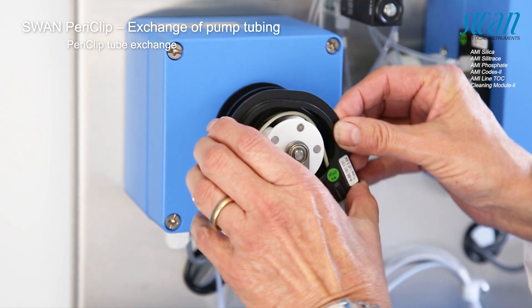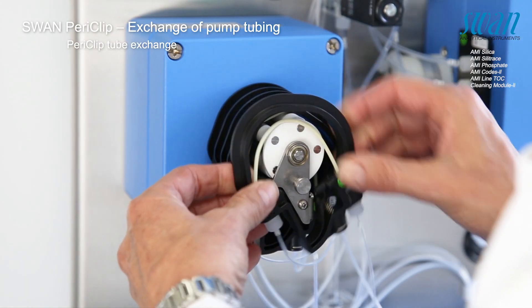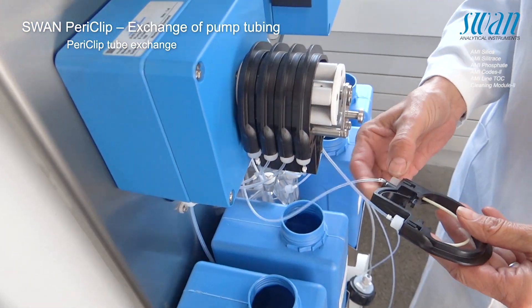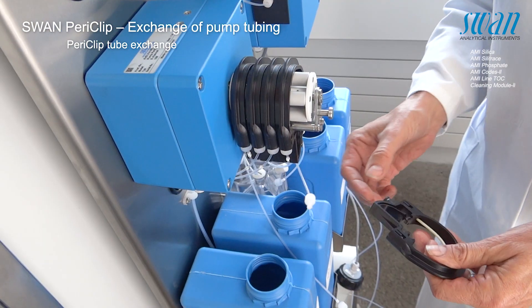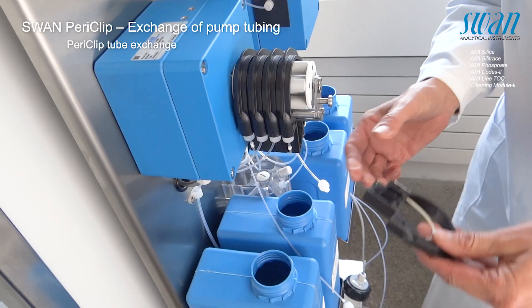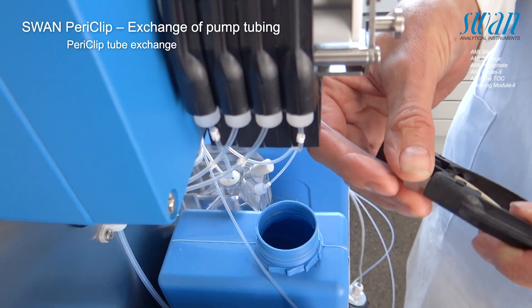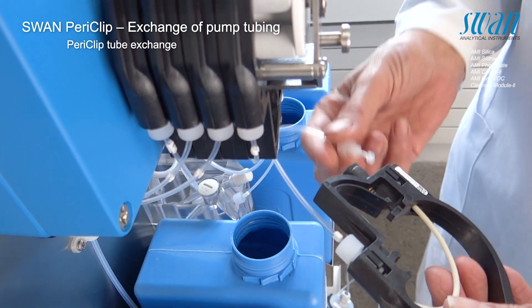Open occlusion frames by turning them counterclockwise. Remove the first occlusion frame from the rotor by pulling the complete occlusion frame out of the holder. This mounts the reagent or sample tube from the occlusion frame. Mount these tubes directly to the new periclip tube frame. Be sure to select the correct tube as they are of different diameters.